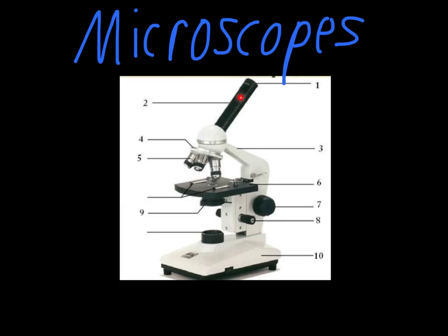The body tube is the next portion. The body tube is just what connects the eyepiece to the rest of the microscope. Number three is an important one for carrying the microscope around. This is referred to as the arm. When you're holding the arm of the microscope and the base of the microscope, that's a nice firm grip. It should allow you to transport them around carefully.